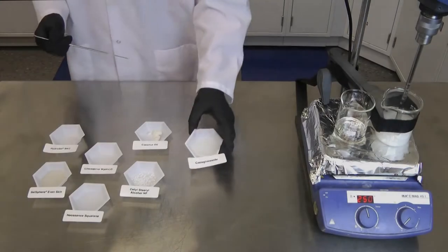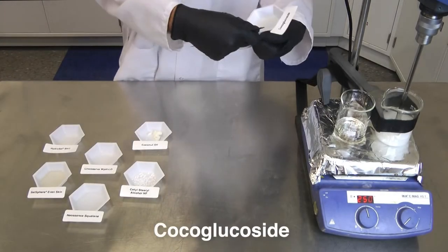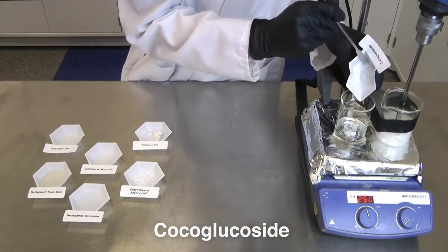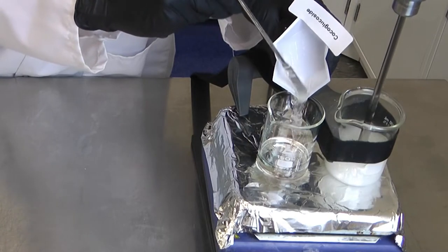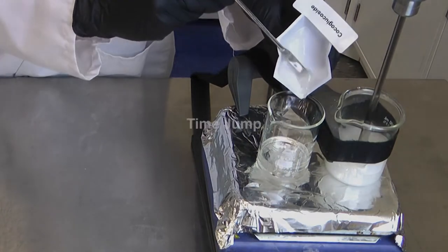The next ingredient that we will be adding to the oil phase is cocoa glucoside. This is going to be our secondary surfactant and will help to build the viscosity of our formulation.